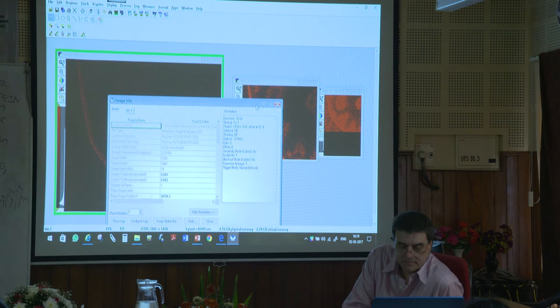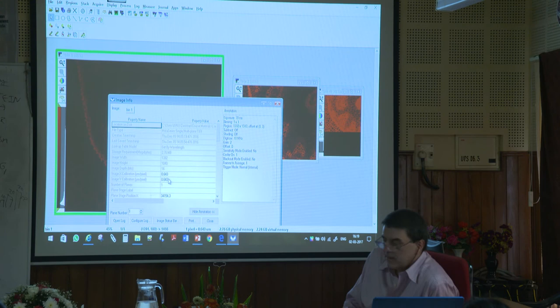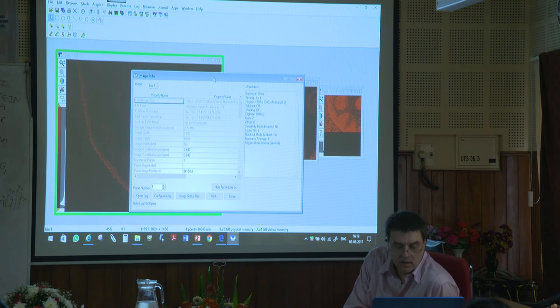Okay, but the other thing is, remember what we got going on here is we have fewer pixels too. Because if I look here now at bin 1, I look at the size of the image. See right here?